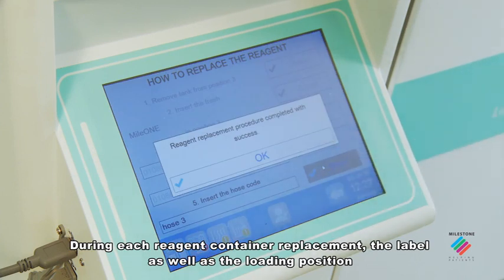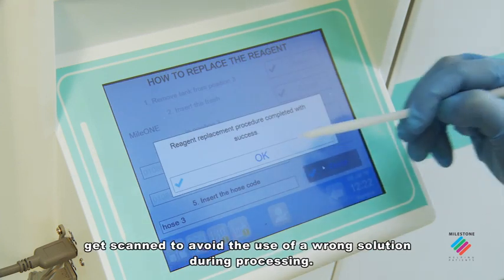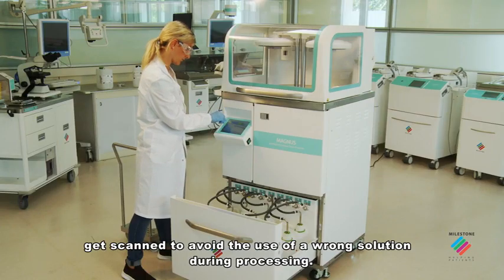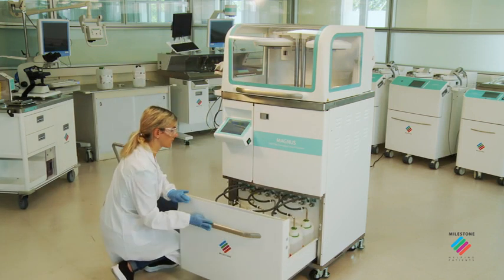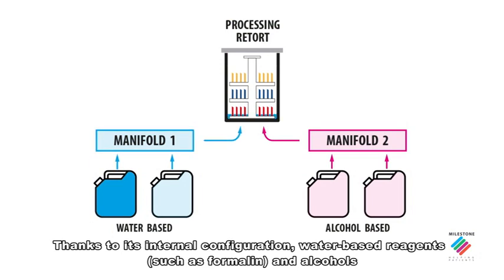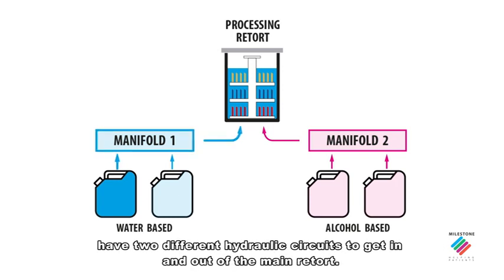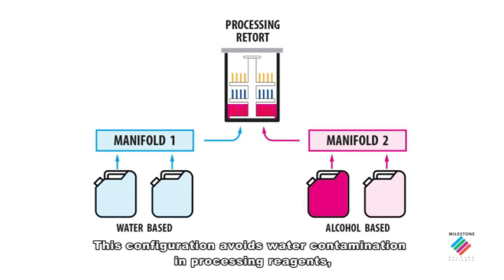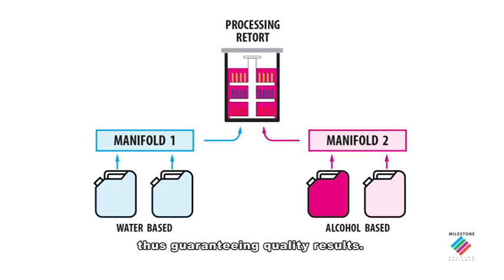The label as well as the loading position gets scanned to avoid the use of a wrong solution during processing. Thanks to its internal configuration, water-based reagents such as formalin and alcohols have two different hydraulic circuits to get in and out of the main retort. This configuration avoids water contamination in processing reagents, thus guaranteeing quality results.